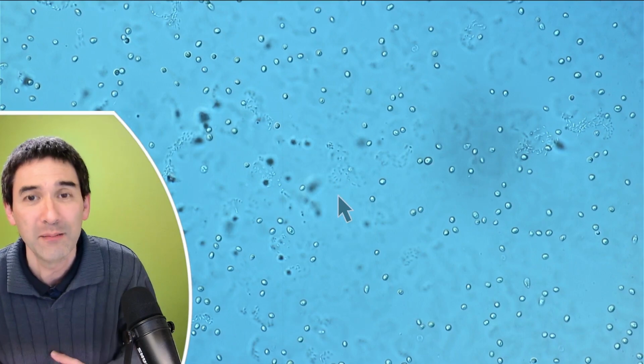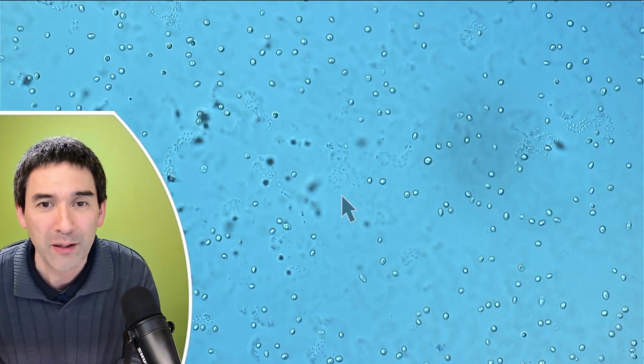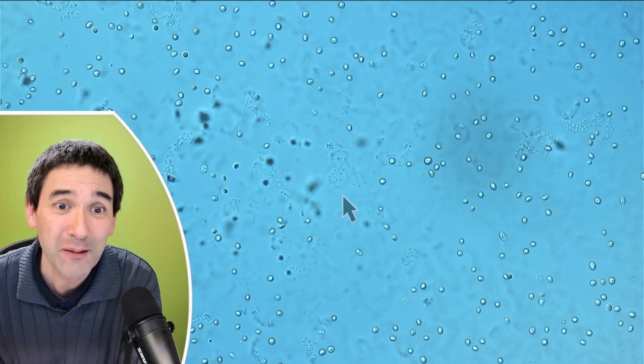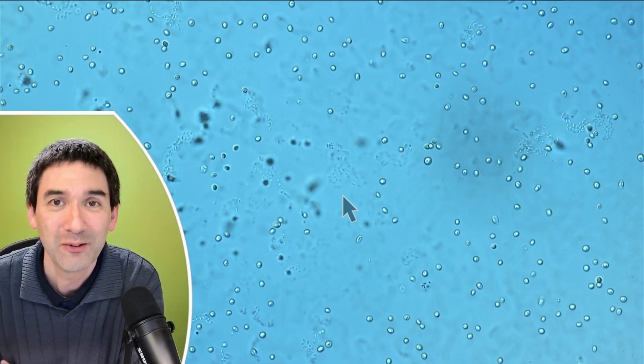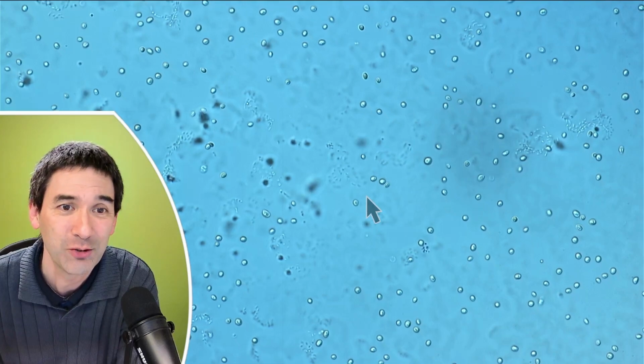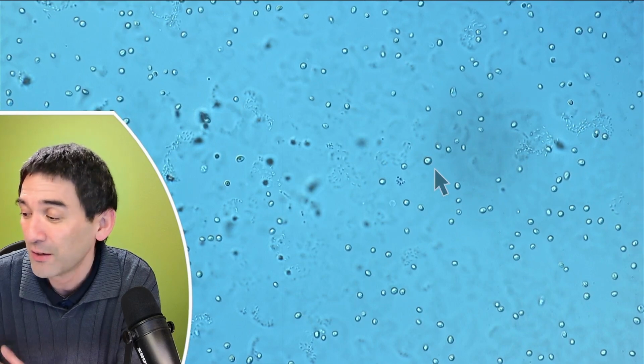So this is an example from biology, Brownian motion being this random movement from physics primarily, and then you see also random movement and directional movement in biology, and that's essentially the connection that I wanted to make here.